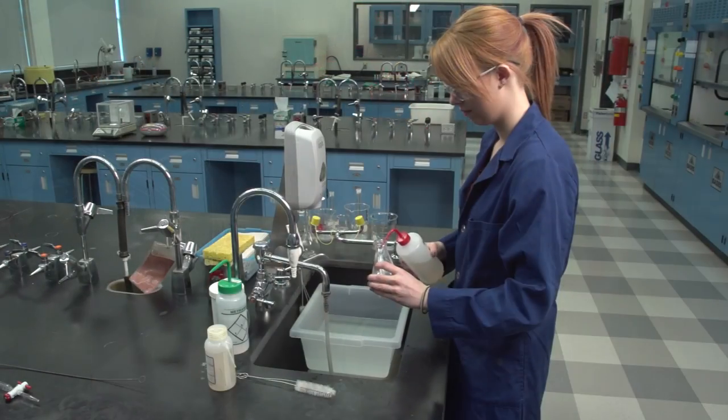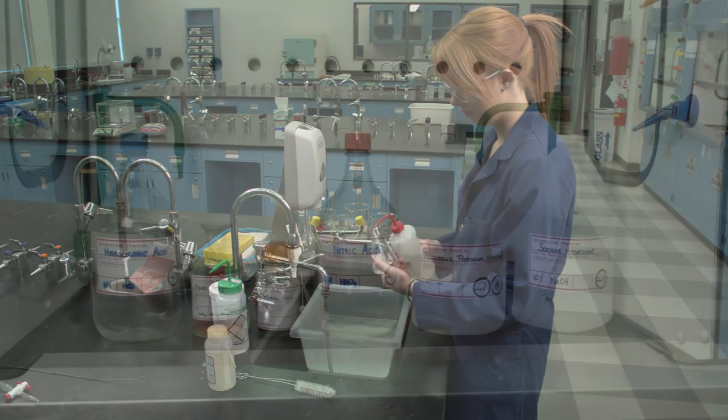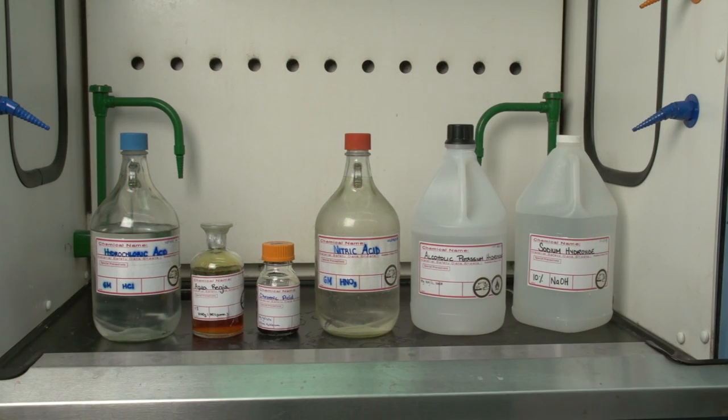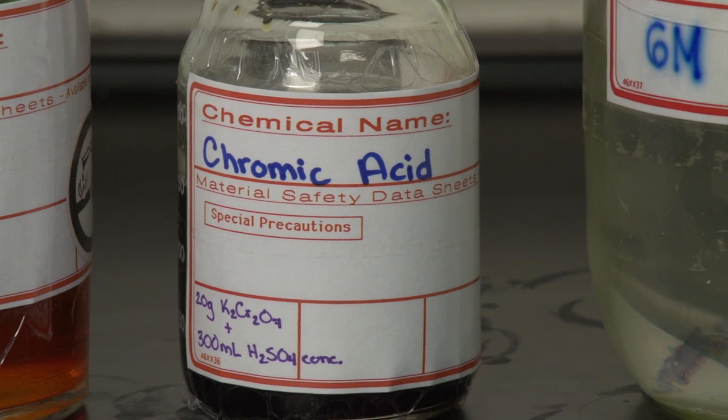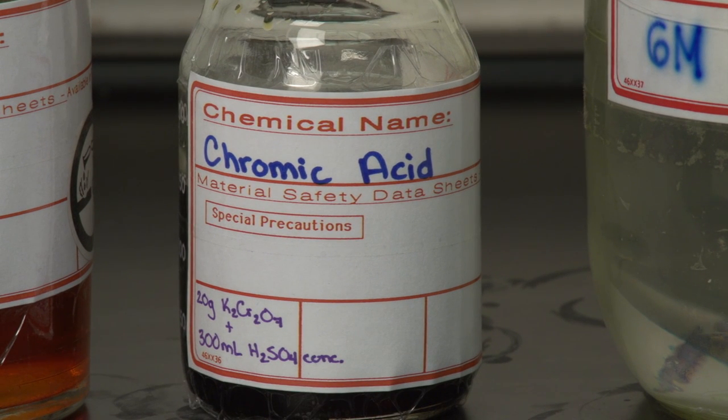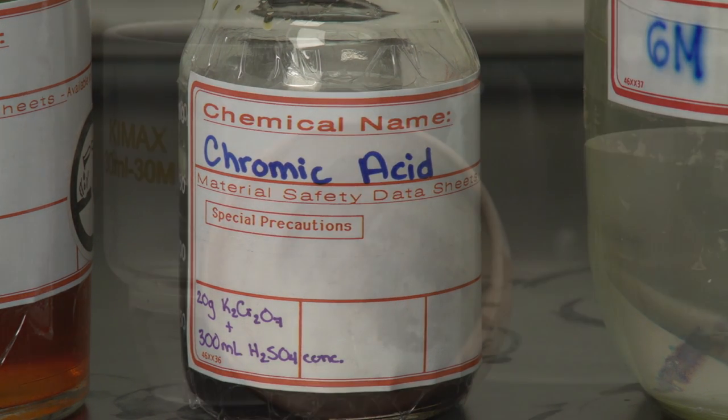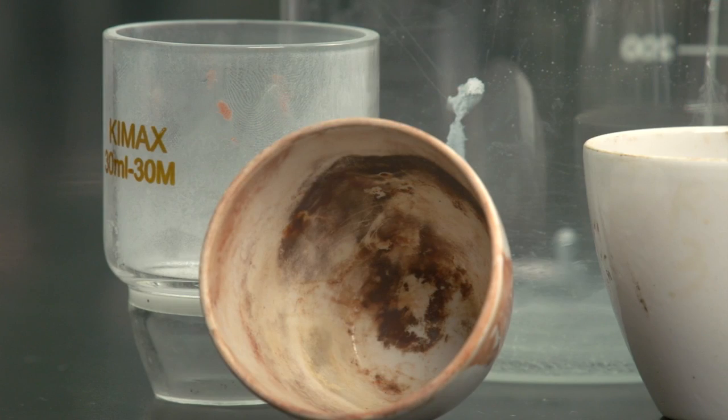If soaking in the appropriate chemical agent is not sufficient, more corrosive agents have to be used. A chromic acid cleaning solution made of chromium-6 oxide in sulfuric acid may be used to remove stubborn deposits.